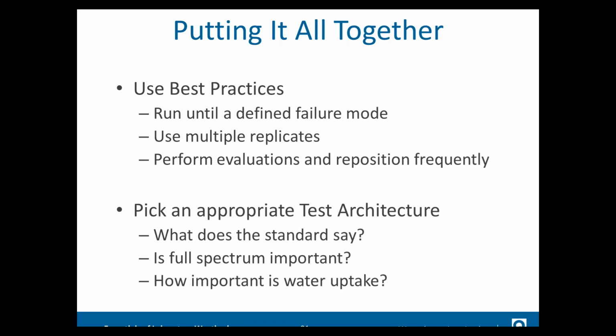And the final one there is reposition frequently. In order to reduce variability in a tester, we usually suggest repositioning a minimum of 4 to 5 times over the duration of a test.